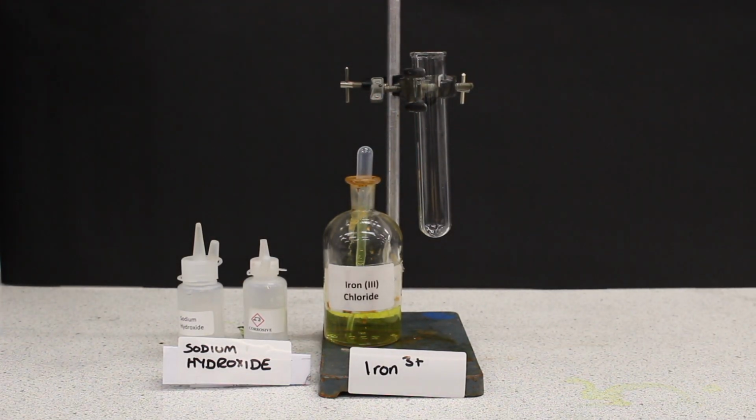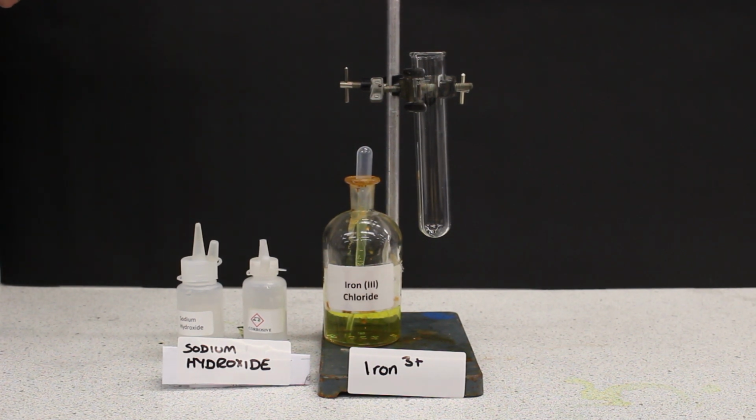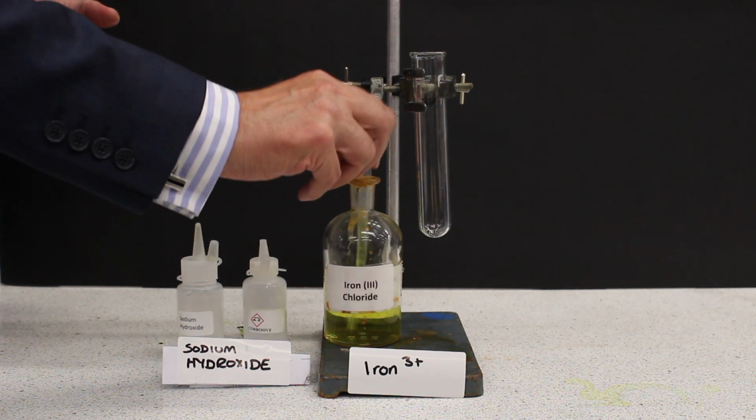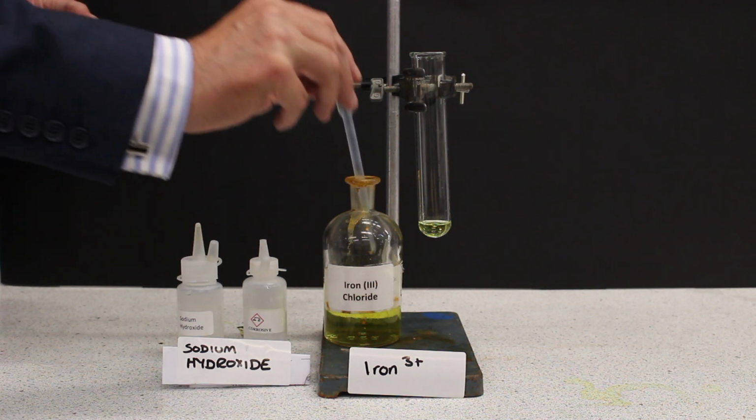So now let's look at our next experiment. Here we're going to put a few drops of aqueous iron(III) chloride into a test tube. Now aqueous iron(III) chloride contains the Fe3+ ion, or more correctly the [Fe(H2O)6]3+ ion. So we're going to put this into the test tube, and then we're going to add a few drops of sodium hydroxide.